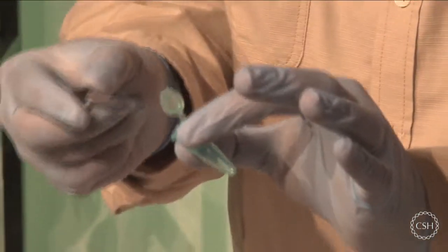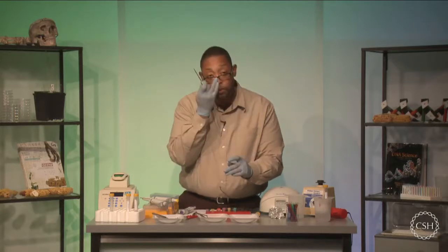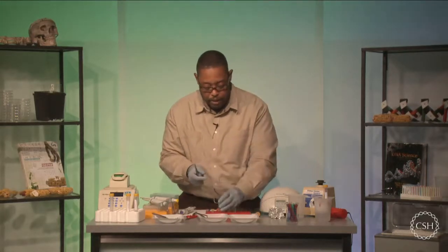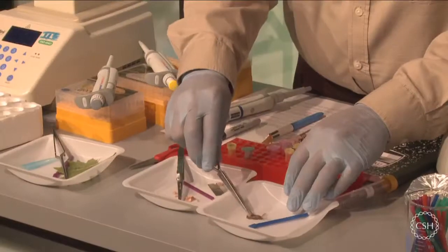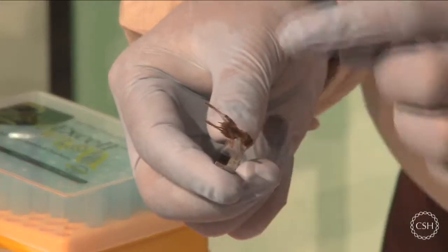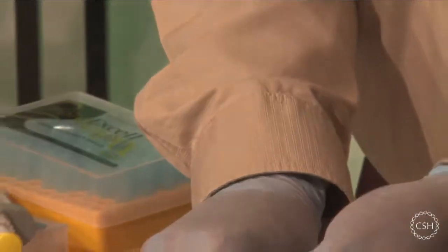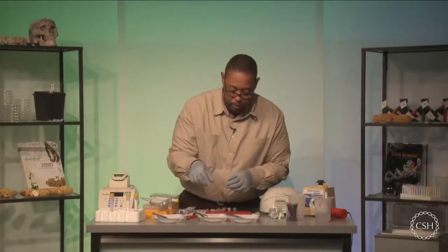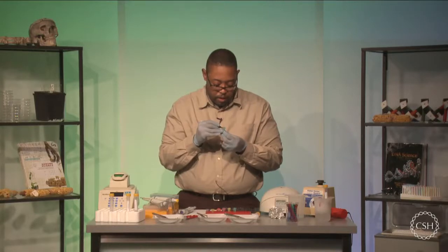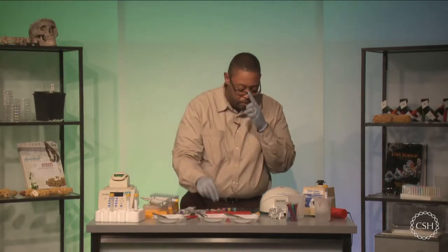So I'm going to take that and add that to my next test tube. Now you may wish to add one leg or two legs. You can pretty much use any number between one and two legs, but if you have a large back leg, like for example, the cricket here has a large set of back legs, you can use one of those or two of the smaller legs in the front. I just took one of the front legs, but that is going to be just enough for me to physically work with here. So I'm going to label this my sample number three, and this is an insect. Okay, so I have samples one, two, and three ready to get started.